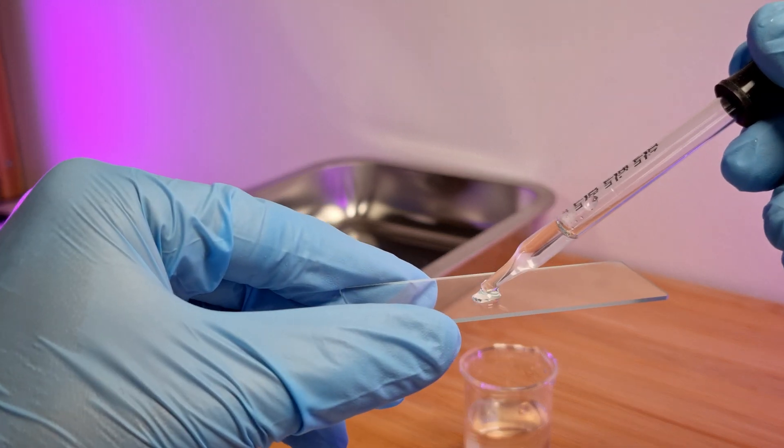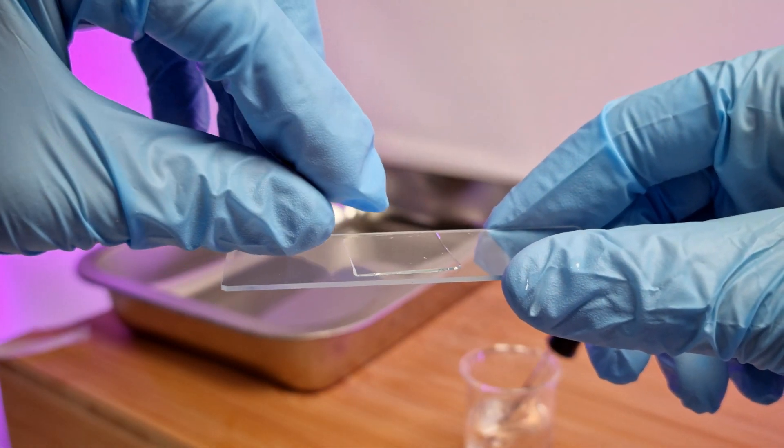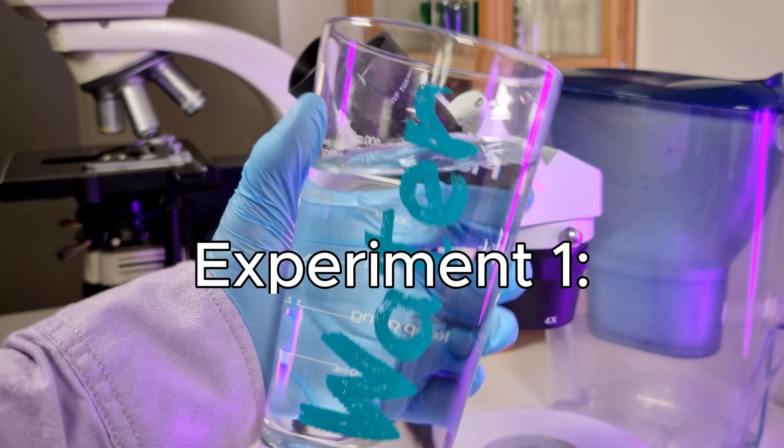When you look at water under a microscope it's hard to tell if the things you see come from the slide or from the water. As expected it's very clean. There are some small dust particles that I'm sure didn't originate from the water.